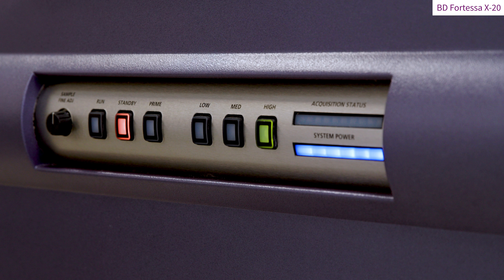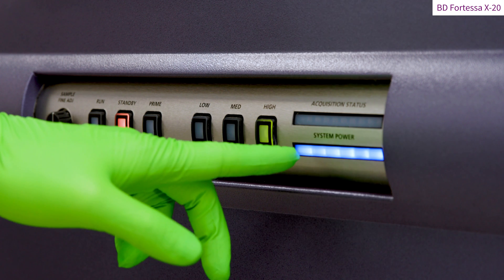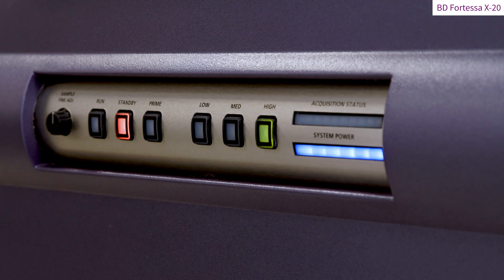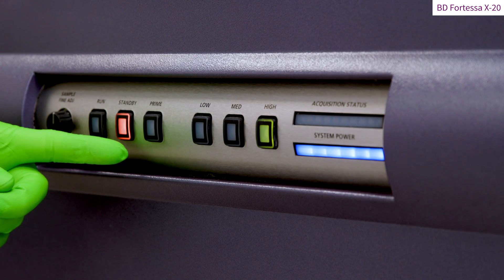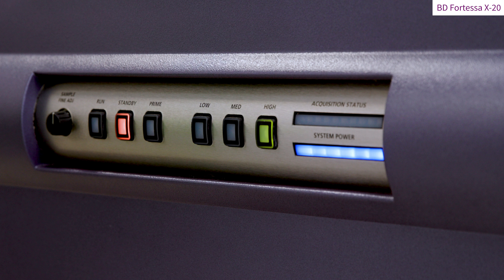The control panel is located at the Fortessa front. The blue light in the power system window indicates that the Fortessa is on. By default, the Fortessa will be set on standby mode after being switched on.